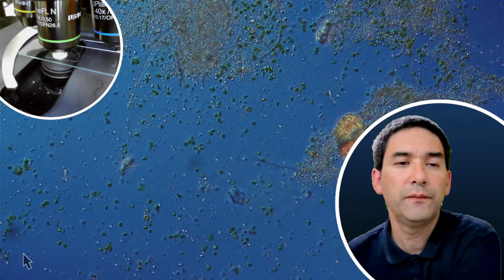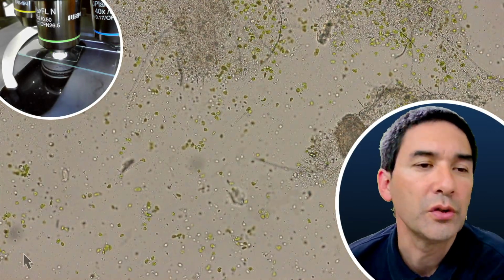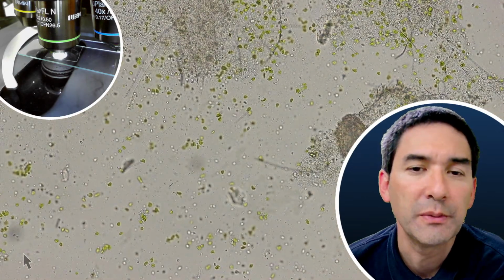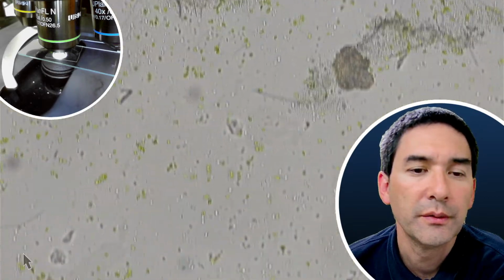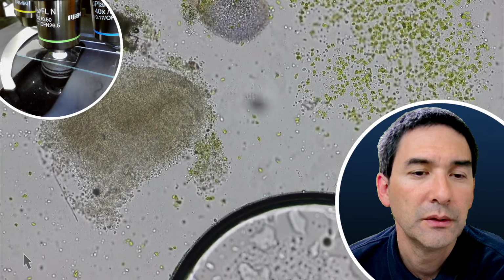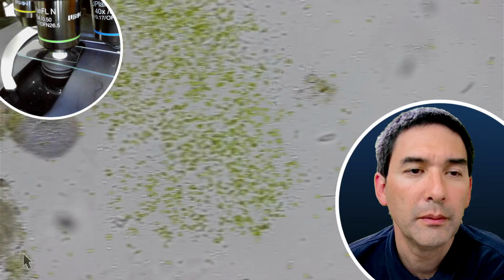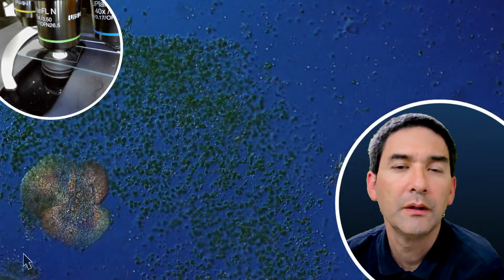And if I want to see the natural colors, then yeah, and these are now the natural colors, and you see that there is of course also some green material also present, which are of course algae or possible cyanobacteria or whatever, which indicates again lots of green stuff here, right? Yep. So this is a decomposing water sample.